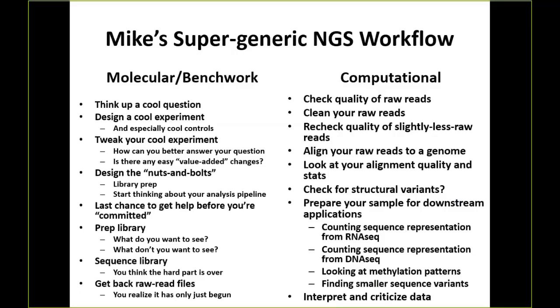obviously with an experiment and hypothesis. You're going to generate a library. You're going to generate reads. And then, actually, let me.